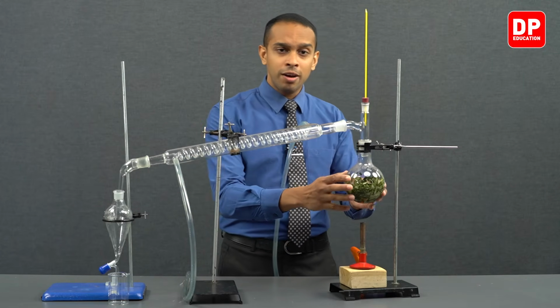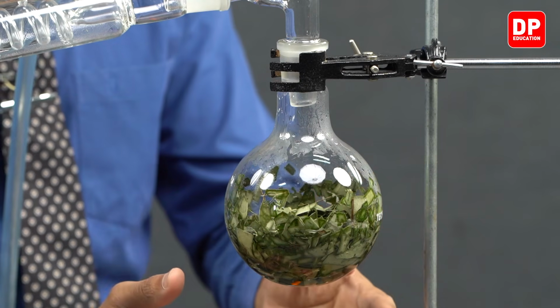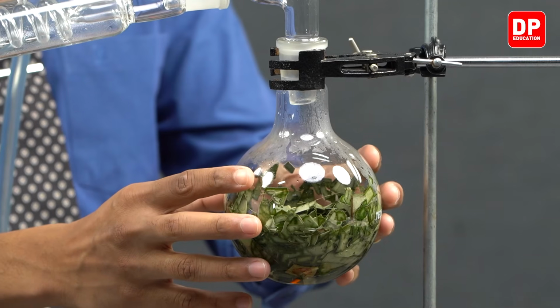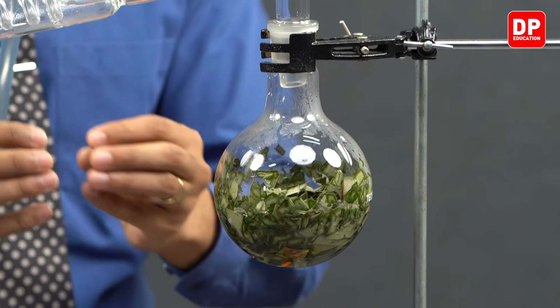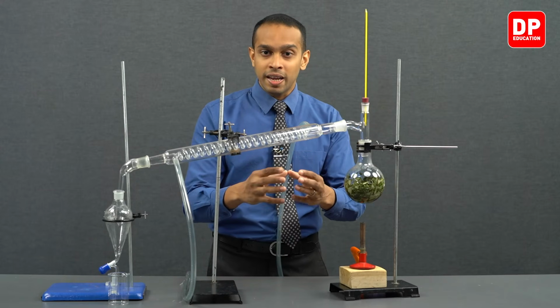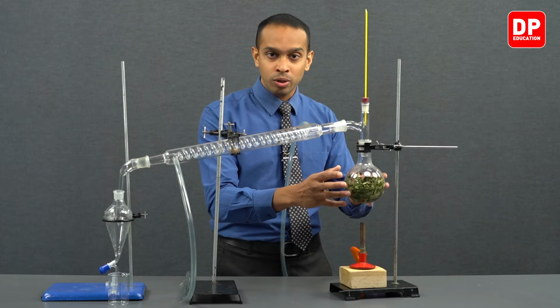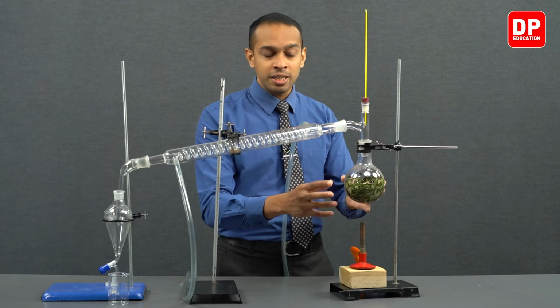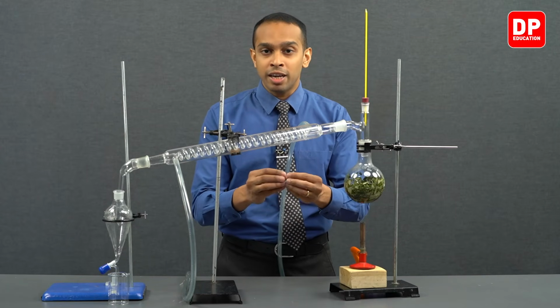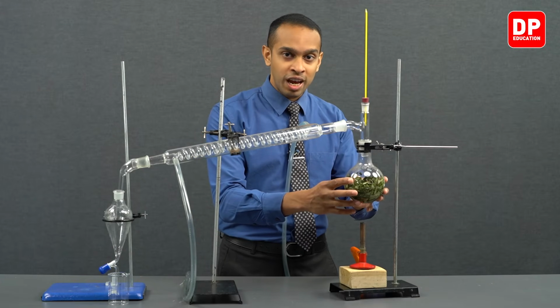However, when you have our cinnamon leaves mixed in water here, when we are heating the mixture, due to the high temperature of the water, we can see the plant cells rupturing and releasing this essential oil into the mixture. So at higher temperatures, when water is about to boil, you will see cinnamon leaf cells will rupture and will release the essential oils into the water that we have here.